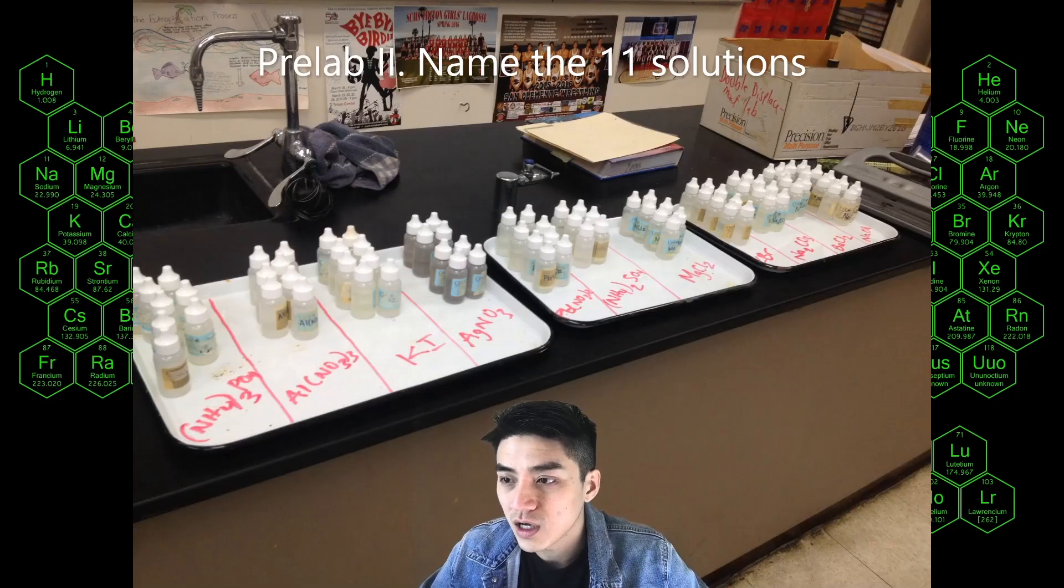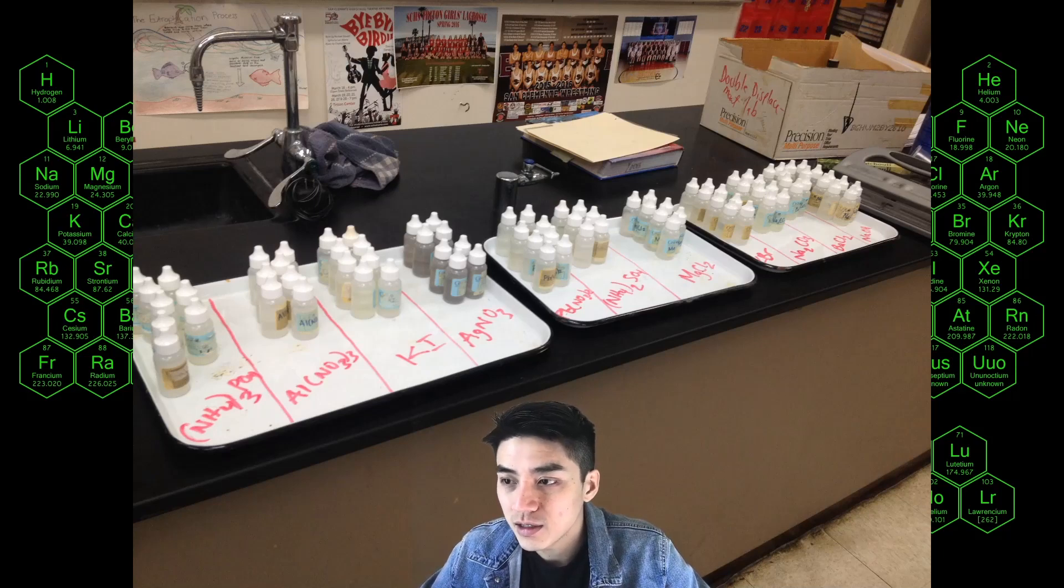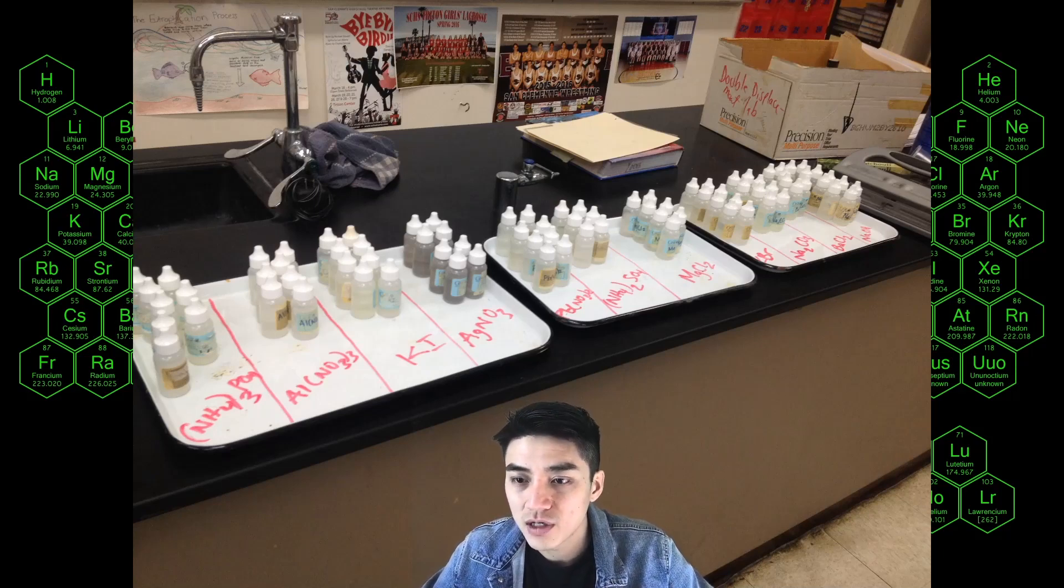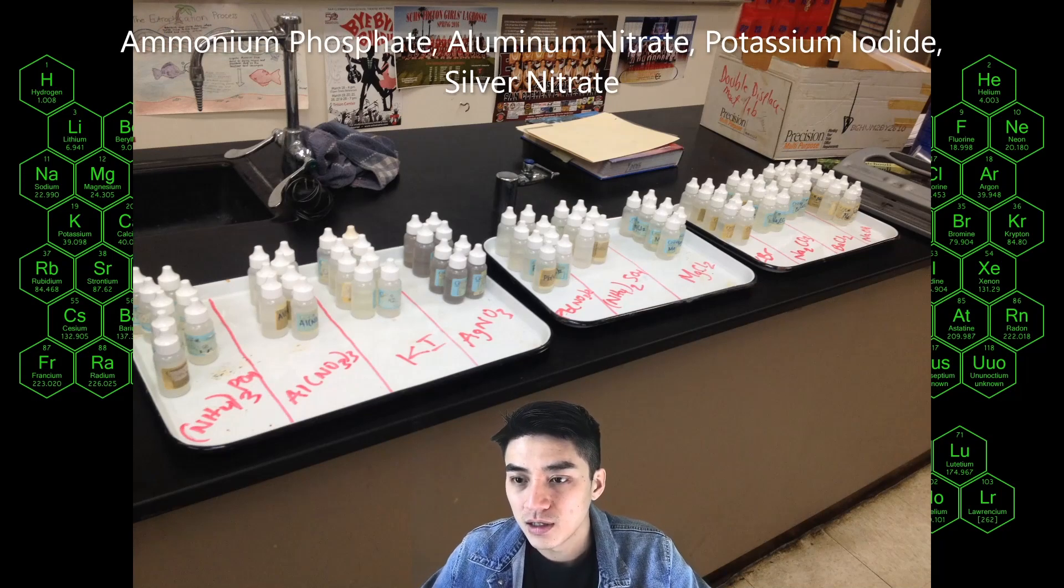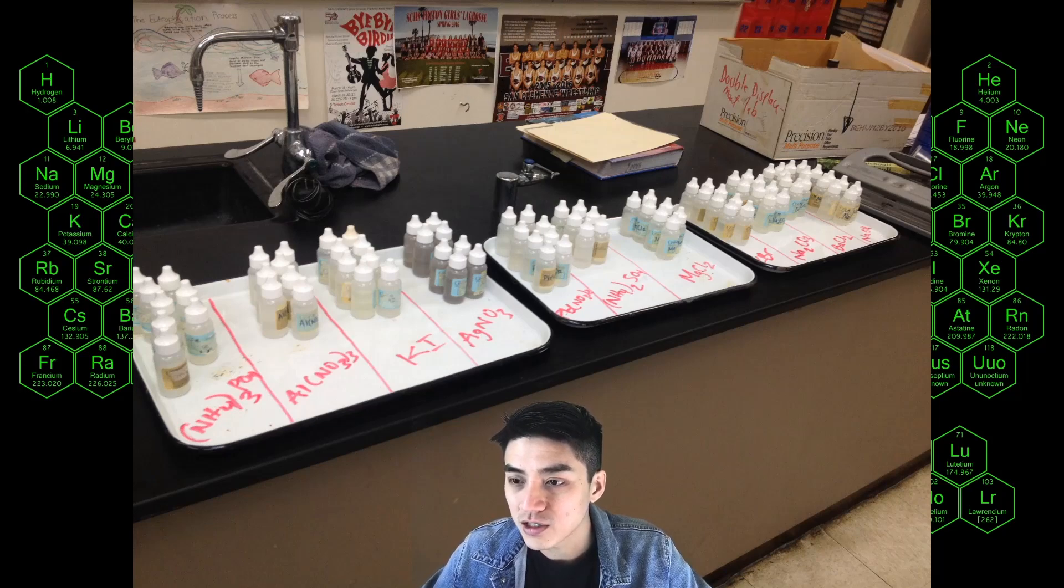These are the 11 chemicals we're going to use in lab today. You will have to name all 11 but I'll give you four of them. So from left to right you have ammonium phosphate, aluminum nitrate, potassium iodide, and silver nitrate.